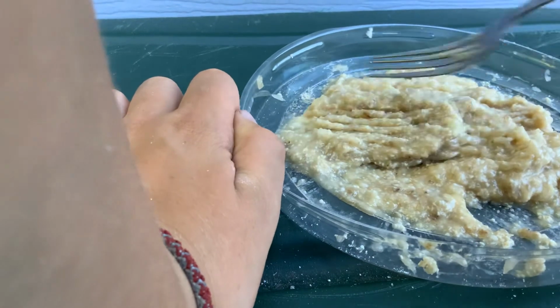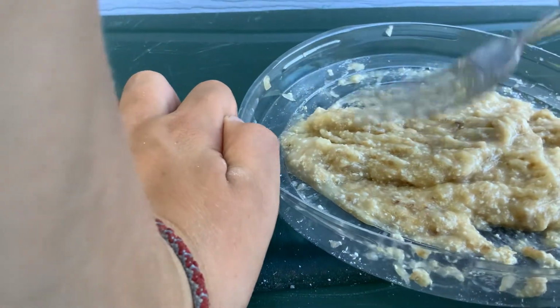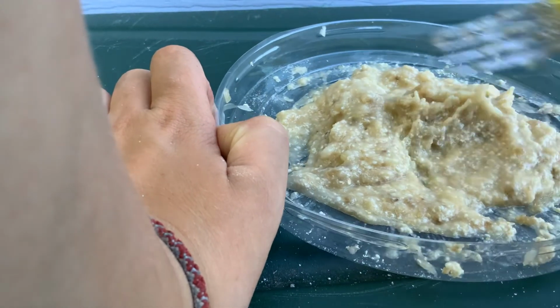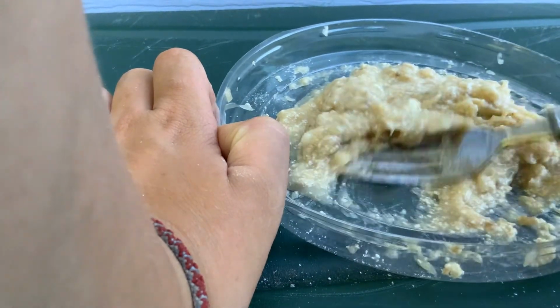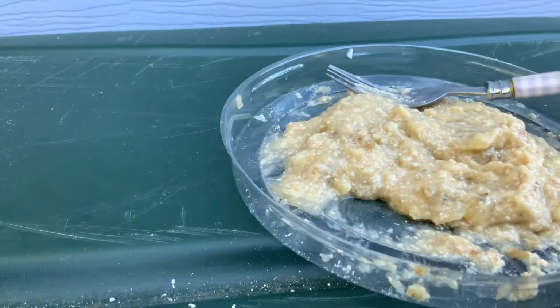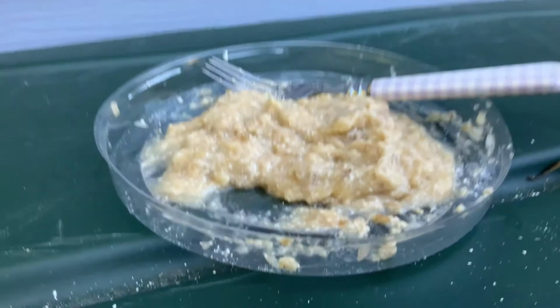I did say that I'd use more vinegar this time. But this was a really big banana, so it'll last. There, just mix it under really well. All right. That is all it takes to make fly media.